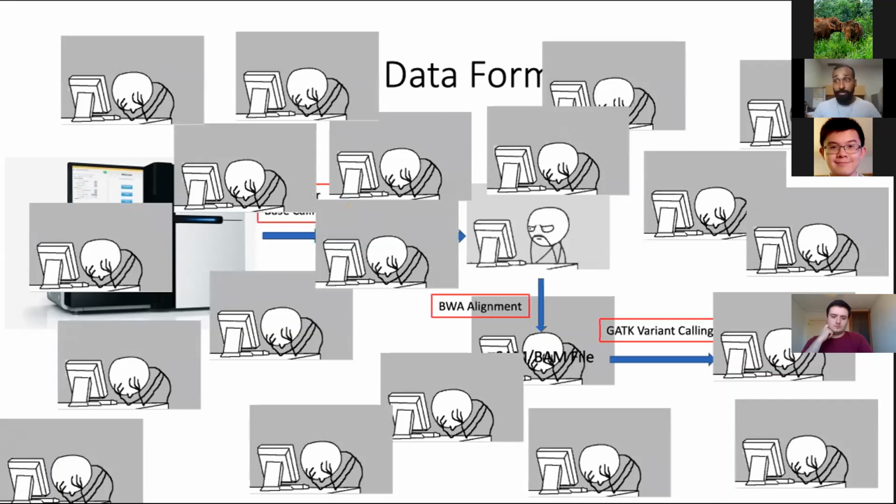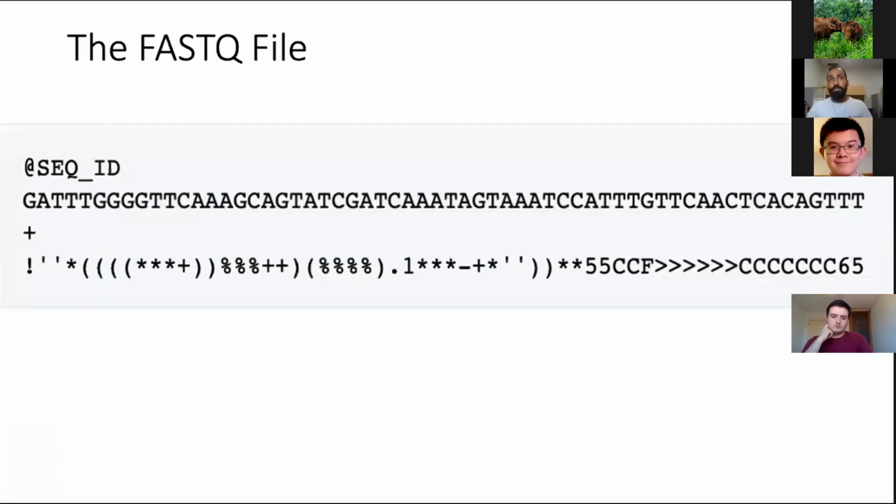So this requires a lot of troubleshooting, but eventually you set up your pipeline and you're good, and you can script it and it will run on its own, clear of errors.